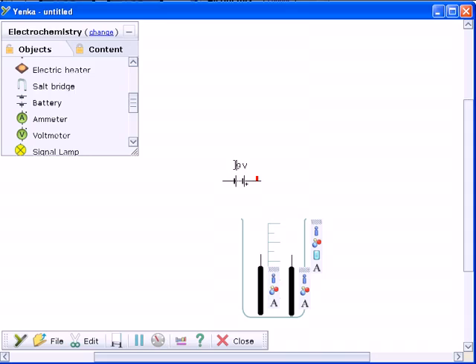You can add a battery, a switch and wires to the electrodes to create a circuit.